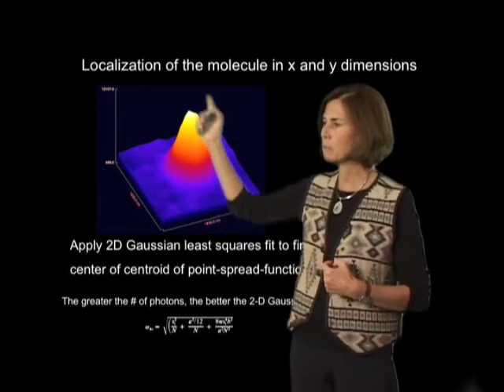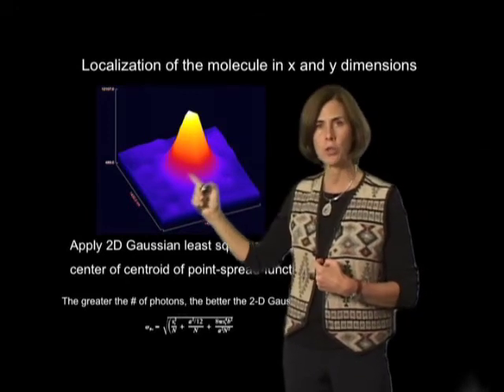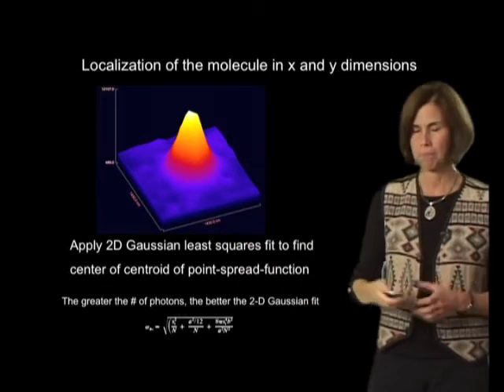When one does that, you can, with very good accuracy, determine where the molecule is situated within that blurry spot.